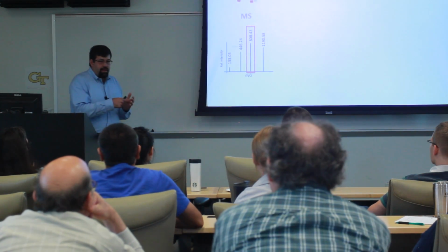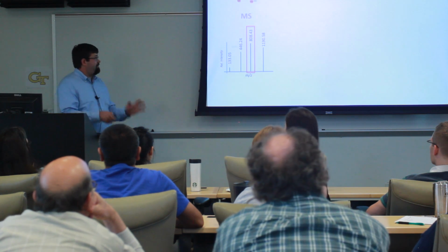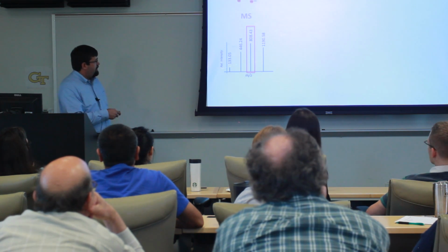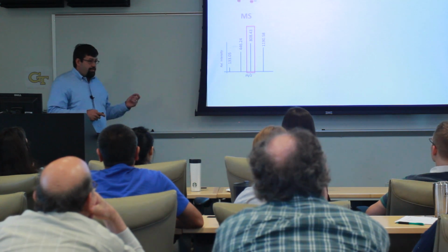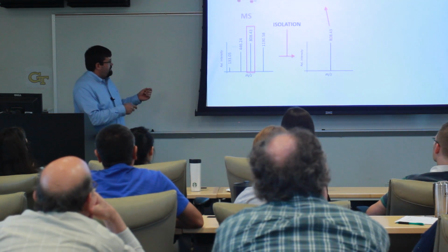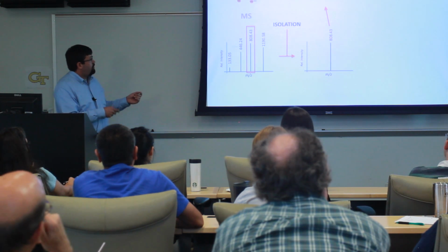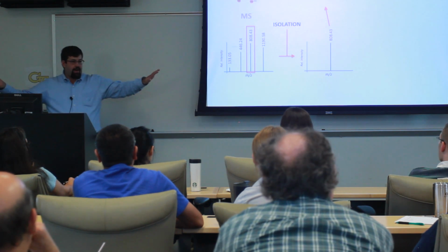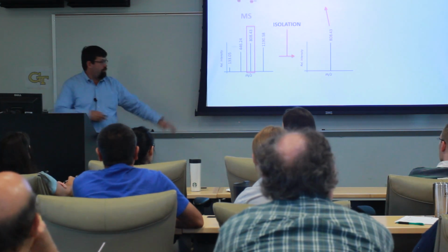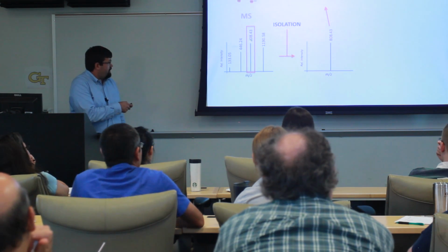We've spotted it, you hit it with the laser, you get ionization, you have now peptide ions in the gas phase, and you get a mass spectrum. And there's our peptide mass fingerprint. We can use that same mass spectrometer to isolate one of these ions. Okay, so now we've used the mass filter to kick out any ions that we're not interested in. We're specifically interested in a particular peptide ion.